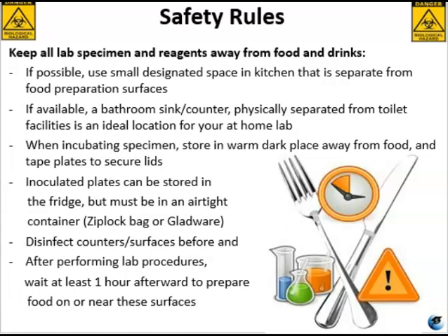Inoculated plates, and sterile plates too, can be stored in the fridge, but you want them to be in an airtight container. So something like a Ziploc bag or a Gladware, like one of those plastic containers with the lids, those would be fine. You want to disinfect your counters or any surface before and after performing any lab procedures. Suitable disinfectants include Lysol, Formula 409 is really good, and obviously bleach, diluted bleach.